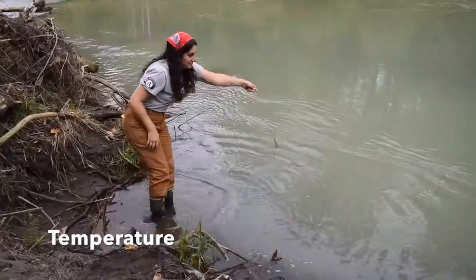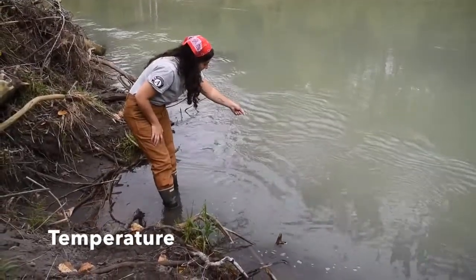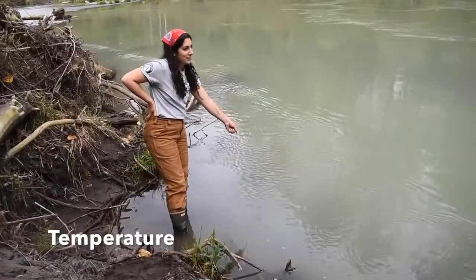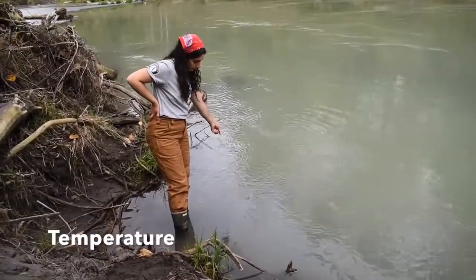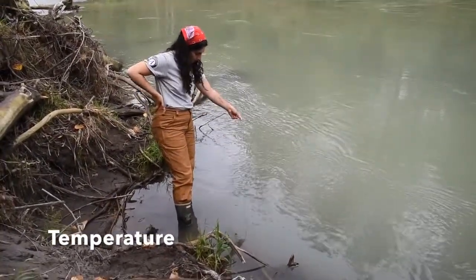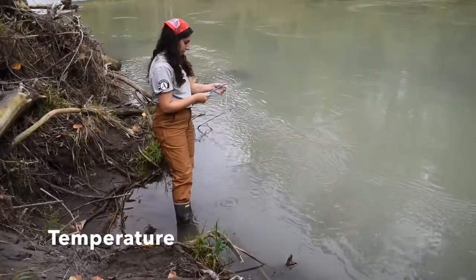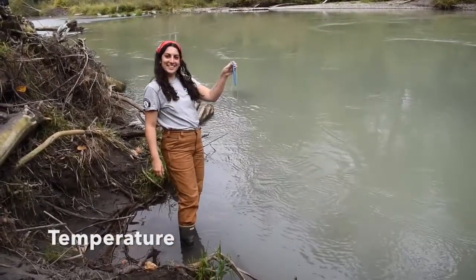The first thing we need to do is measure the temperature of the water, so I'm going to hang this thermometer in the river for one minute. Salmon want cold water less than 12 degrees Celsius. The temperature of the water reads 14 degrees Celsius.